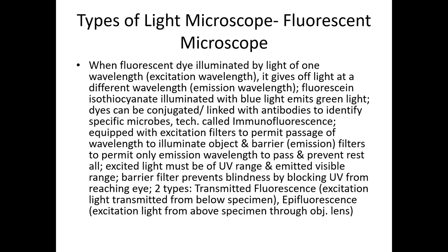For example, if we are using UV range or UV light as the excitation light, that means we are using UV light to illuminate the object. Now, if the same light passes into our eyes, what will happen? We will become blind, definitely.